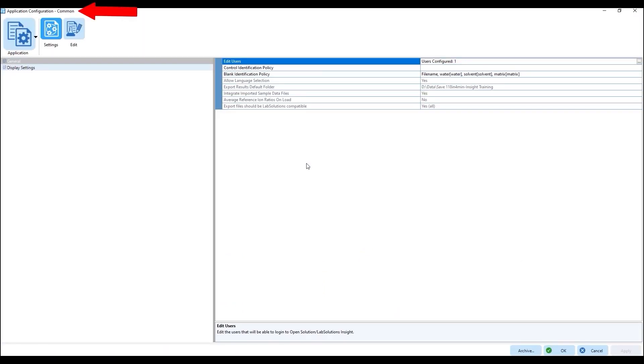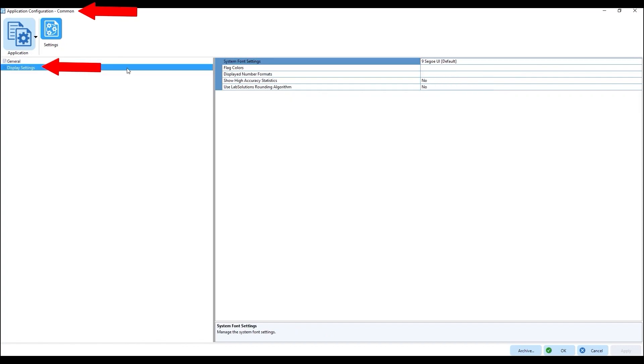The colors used for flag colors and results can be set in application configuration in the common display settings under flag colors.